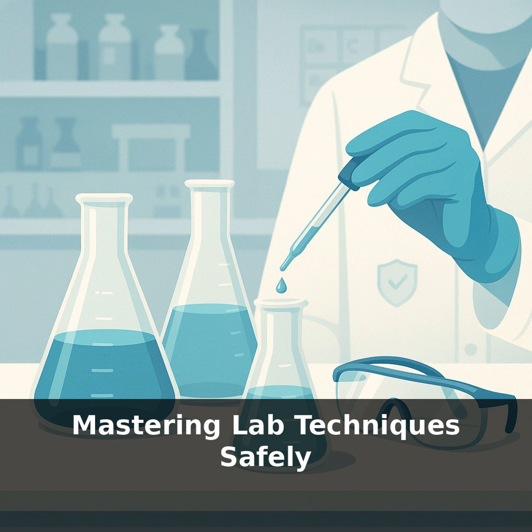A lot of lab training treats stirring rates and hot plate settings like background details. Set them, forget them, and focus on the real chemistry. But the data tell a different story. Most serious incidents don't start with exotic reagents. They start with unnoticed gradients in concentration and temperature quietly building inside ordinary glassware.